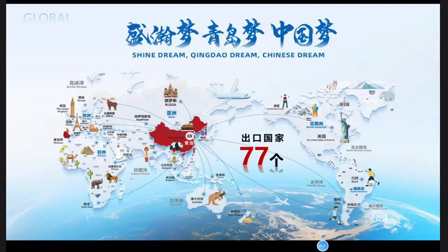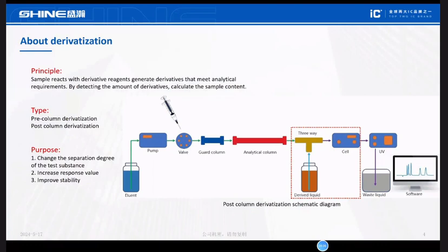Presentation. So I just show you the picture. Okay, here it's about the derivatization. The principle is the sample.